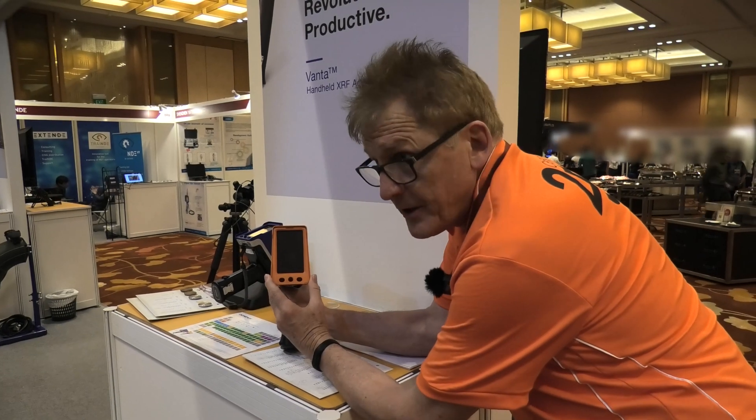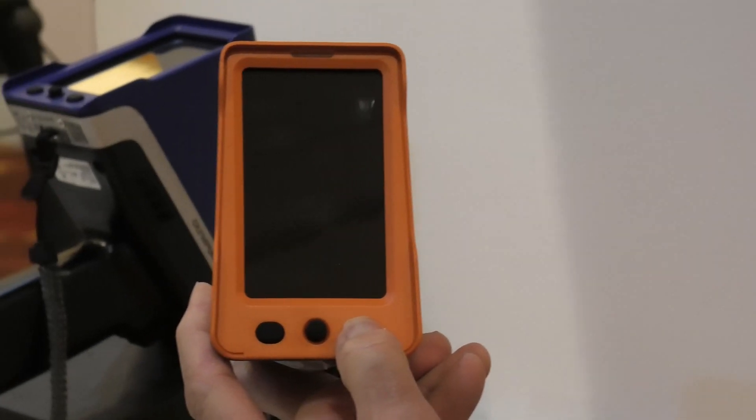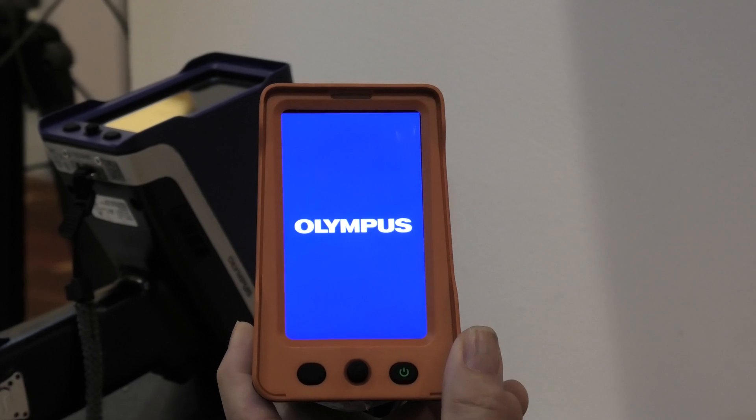To power the instrument up, we simply push the on/off button. We hold it down for a couple of seconds, release, and now the instrument's powered up.